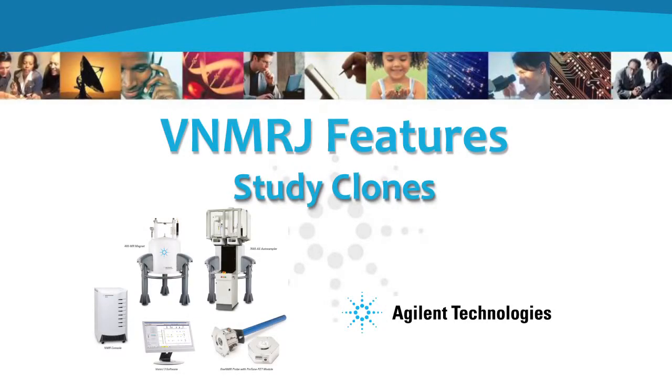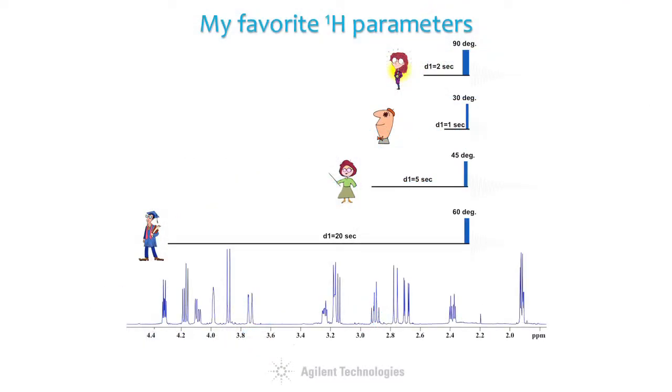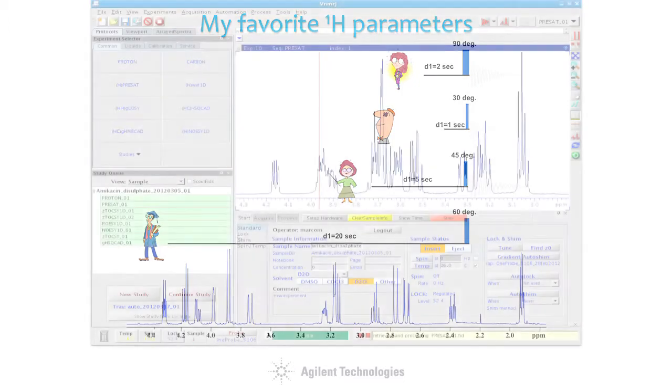There are as many different experimental configurations for proton NMR spectra as there are spectroscopists that run them. Local workflows and requirements mean that everyone needs something a little bit different. Occasionally even the same person might need different conditions at different times or with different samples.